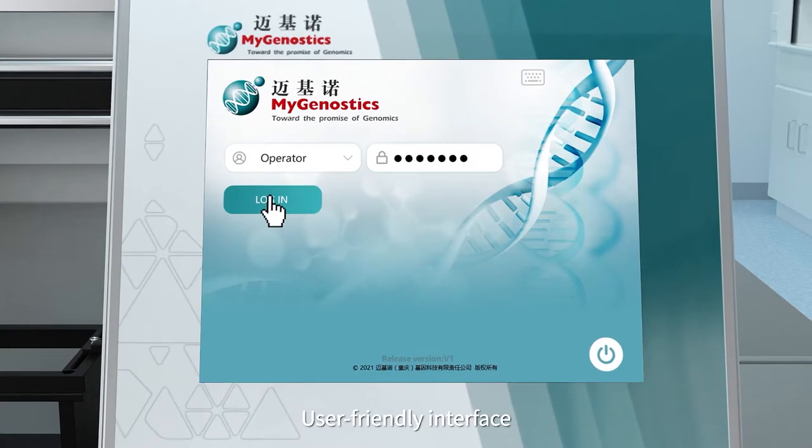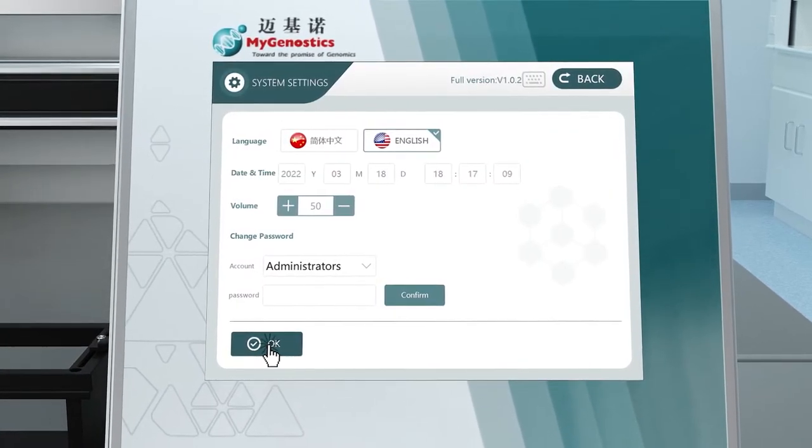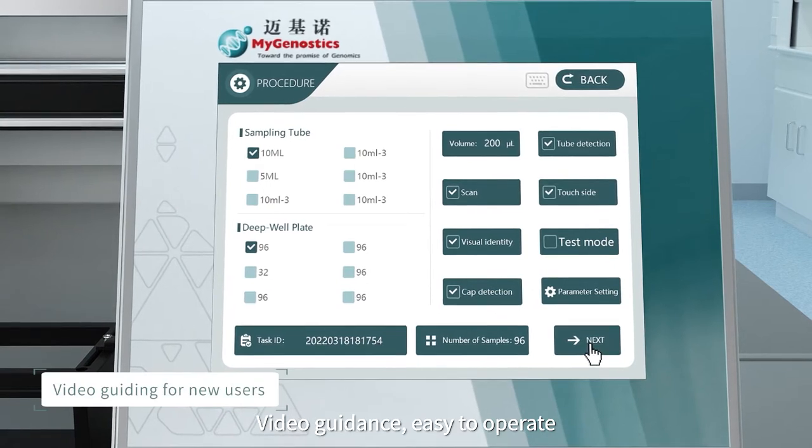User-friendly interface. Multi-language available. Video guidance. Easy to operate.